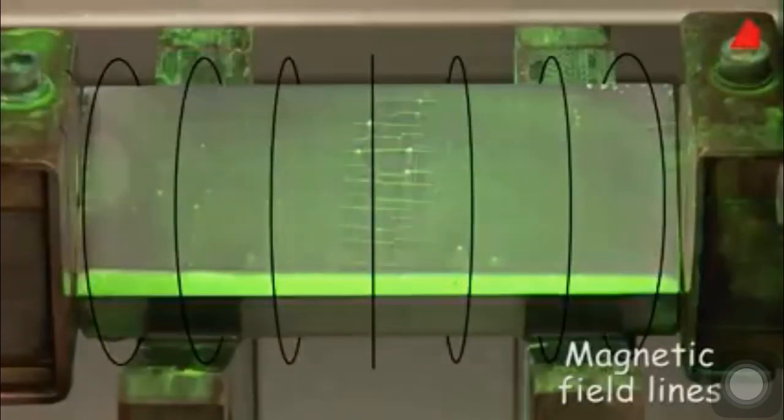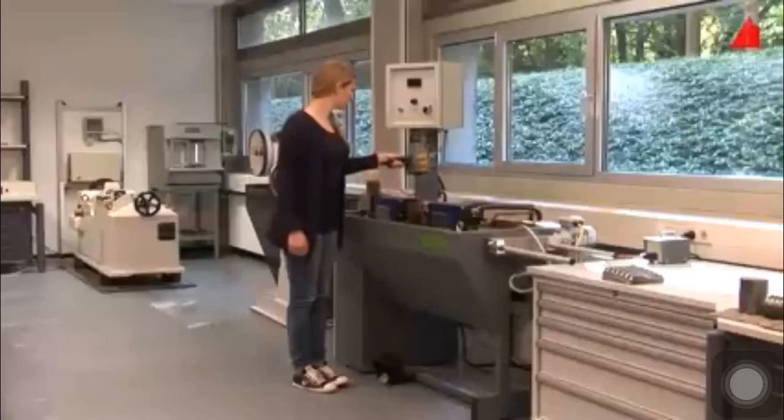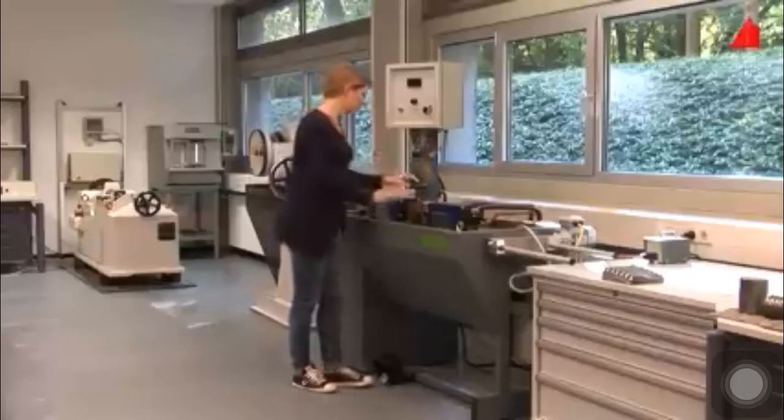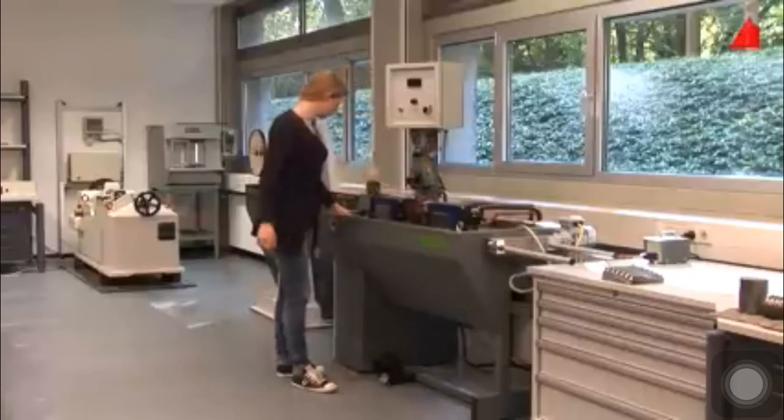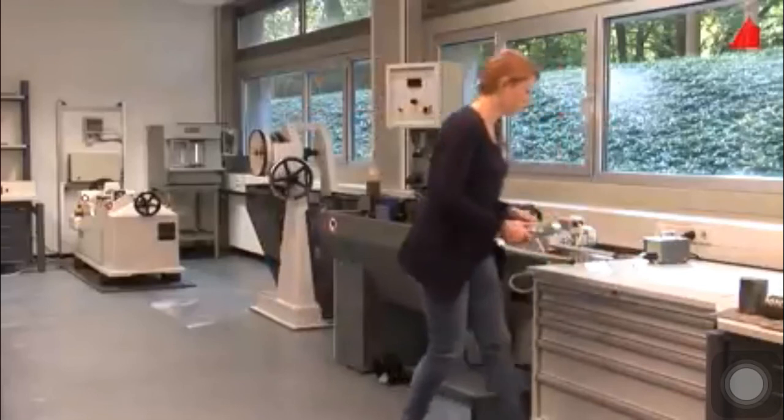The tested sample is a hardened sliding guide. The cracks have been formed during the hardening process and the subsequent grinding operation. Still another test piece has to face the magnetic particle inspection, a section of a large gear wheel. The same procedure again.